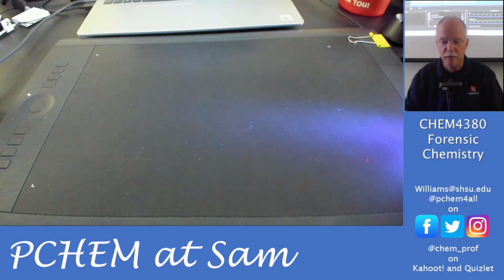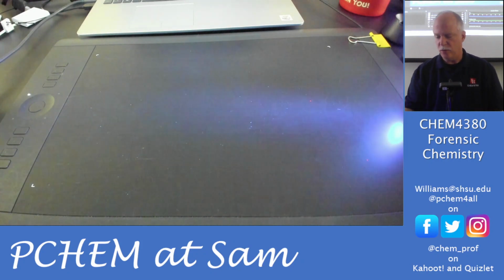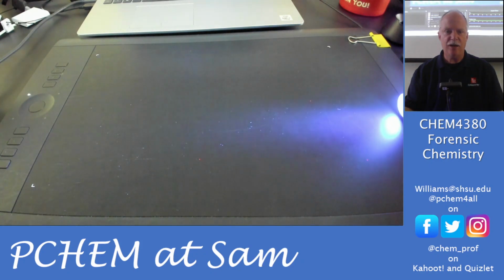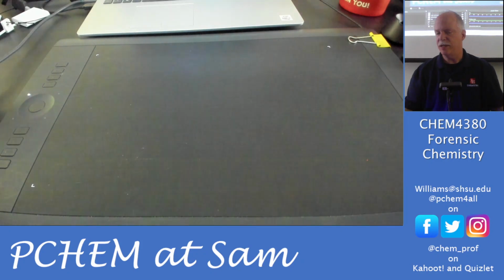Okay. So even if you don't have a fluorescent sample or a UV light source, just a regular flashlight shining at a grazing angle across the surface, all your particles are going to leave shadows. And so you'll be able to see really small particles with a grazing angle.